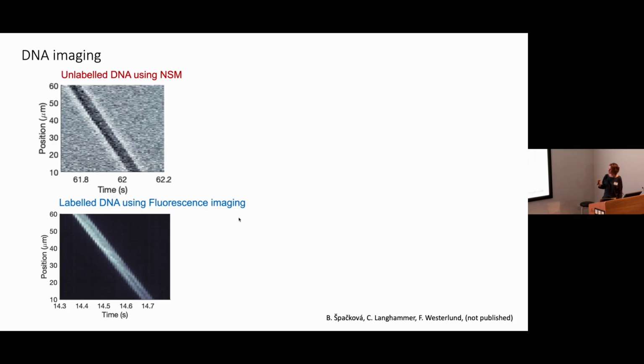It's also important to say that the configuration of this instrument enables not only label-free, but of course also fluorescent imaging format. And this dual modality allows us to directly compare between those two formats in the same instrument and exactly the same experimental conditions.